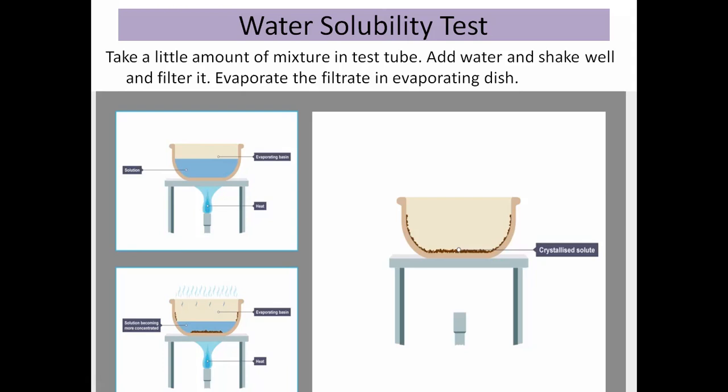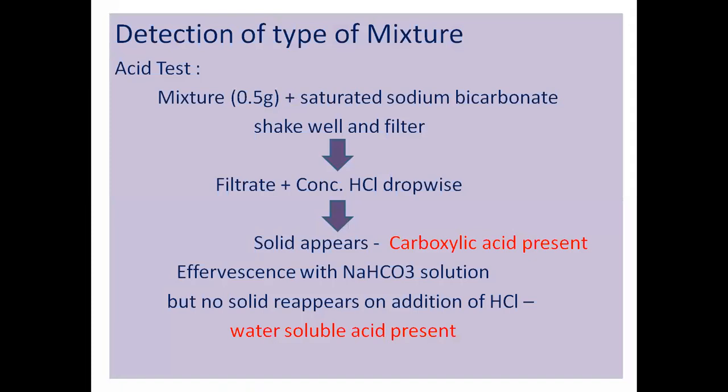If your compound is water soluble, then you will take the water as a separating agent, okay, separating reagent. So this is for the water soluble compound you have. Now the other possibility is that you have water insoluble compounds.